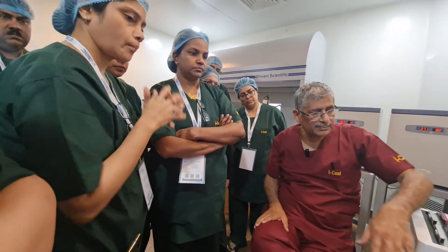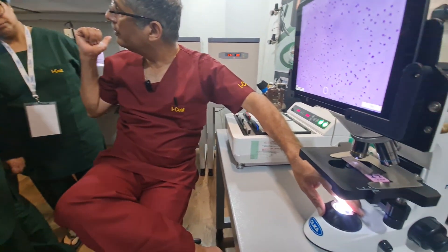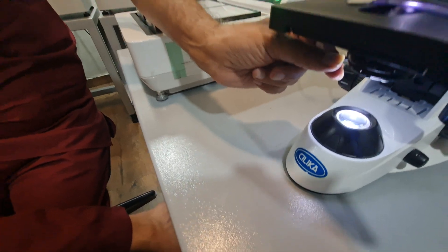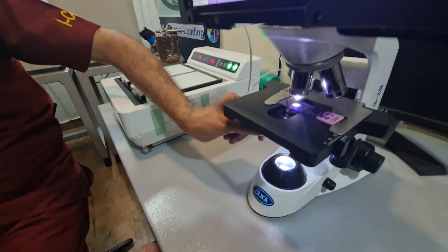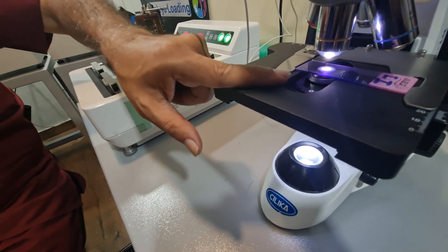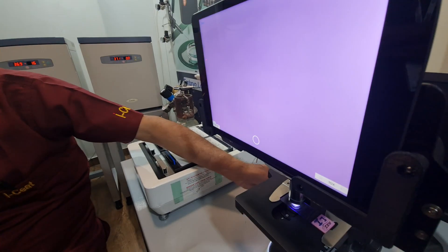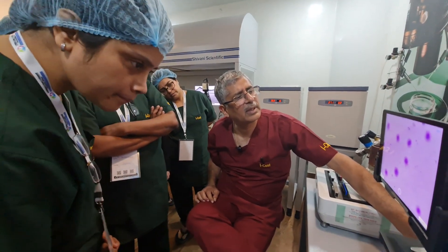This is one type of microscope. How does it work? Light comes from below. This is the condenser here; this is the light source. We have kept the condenser to have more or less light. Light goes up and will always come through a small aperture, go to the objective and into the lens. So the condenser has to be kept at the highest.